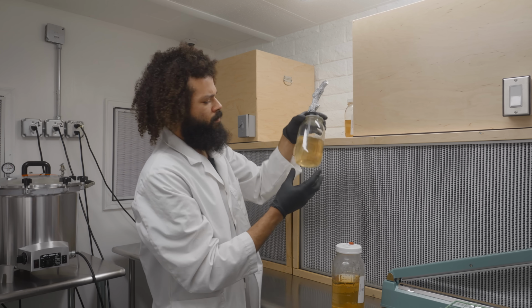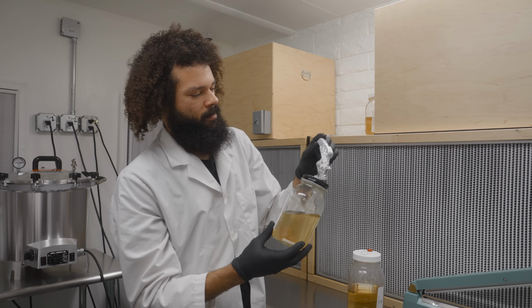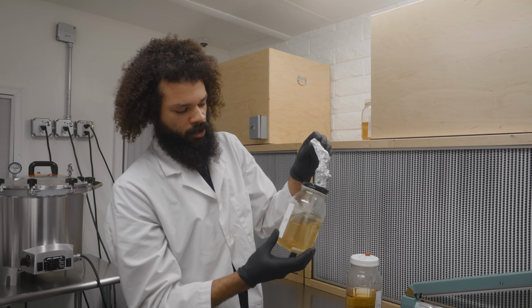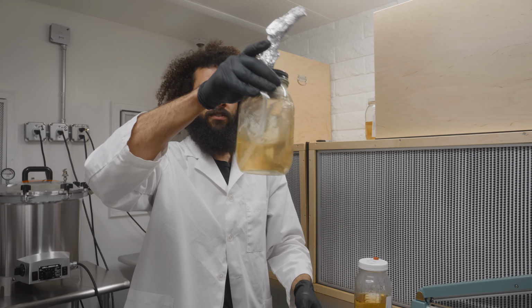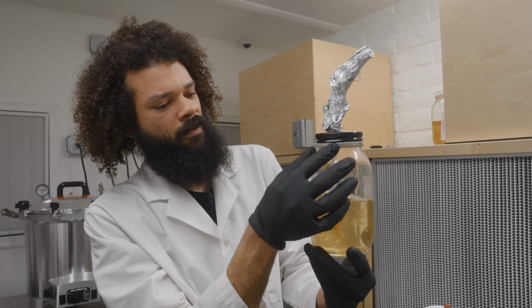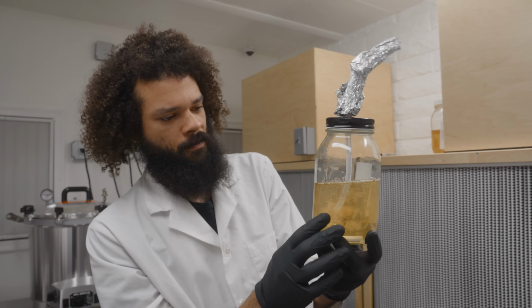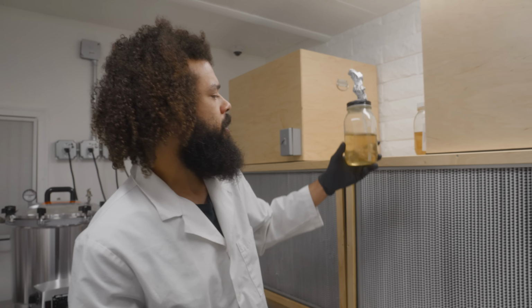We also were experimenting with these lids, and they have basically a place where you can connect your syringe and just suck the mycelium straight up out of the jar without having to really tilt it. So this actually came from a company called Agar Addicts, so really cool jar lid. Yeah, seems to be working really good.